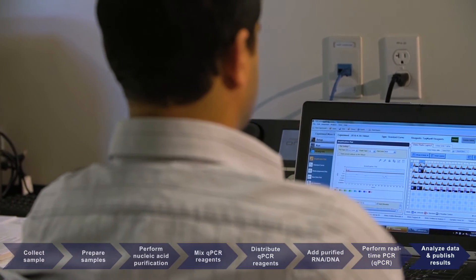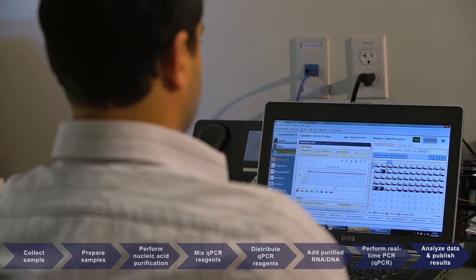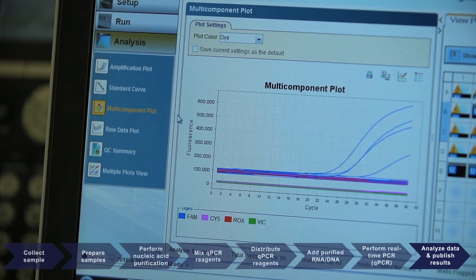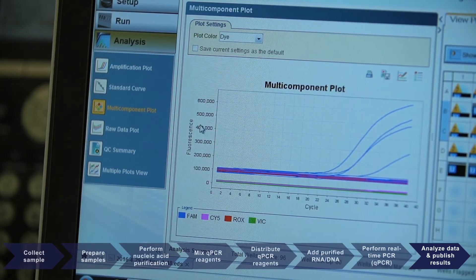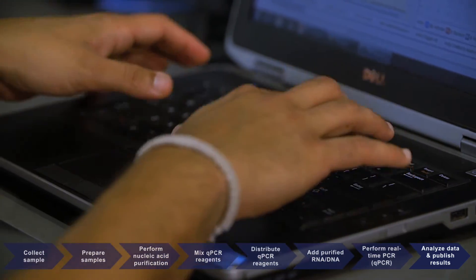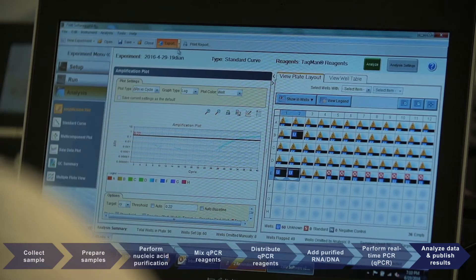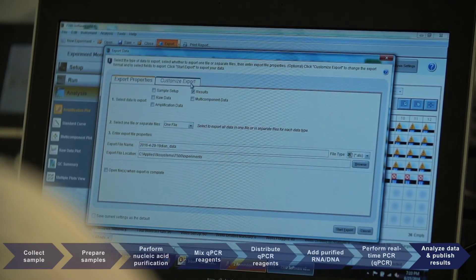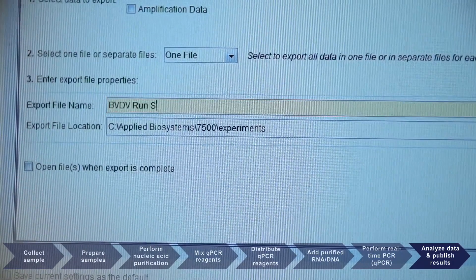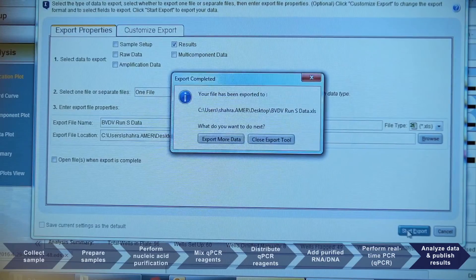Once the PCR run is complete, the data can be analyzed using either user-defined or software-derived criteria. By simply selecting the PCR wells of interest, the amplification plots can be viewed and analyzed accordingly. Data can be easily exported in a variety of formats for labs to generate and share results with their customers.